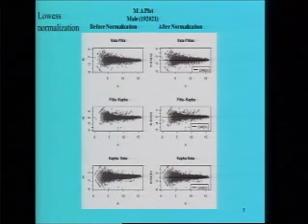So if you now look at the right panel MA plots, the first corresponds to Vata and Pitta, and then the vertical line passing through m equal to 0, that is, m minus estimated m, is the normalized m value. It passes through m equal to 0, and the points are symmetrically distributed around the line.